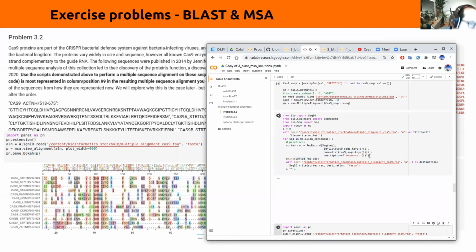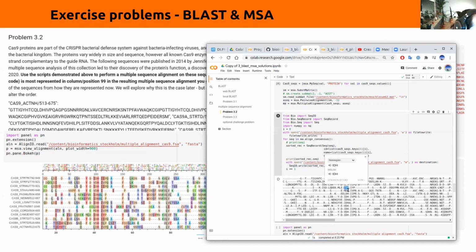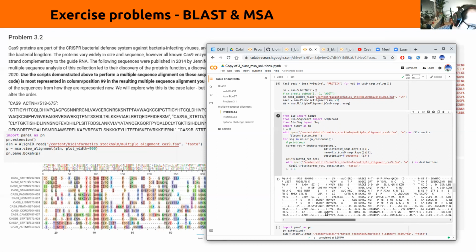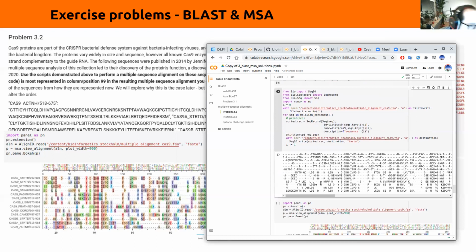And if we print out the sequences from this alignment, which have gaps inserted, in order like this, line by line, this actually becomes our multiple sequence alignment. And you can even start to see conserved columns here of conserved amino acids. So each position here corresponds to a position in the multiple sequence alignment.